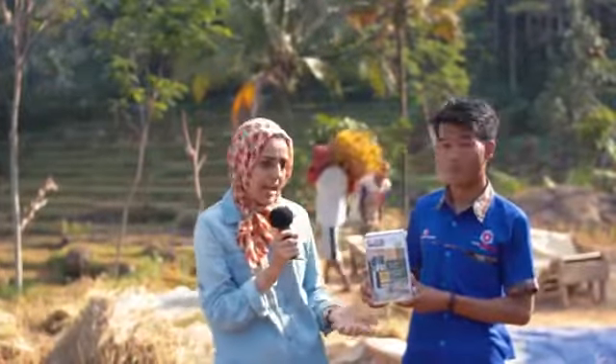It's a rather economical and very simple method, and it also produces low moisture content in grains, which brings us to the product we'll be presenting today — the Wild 55 moisture meter.